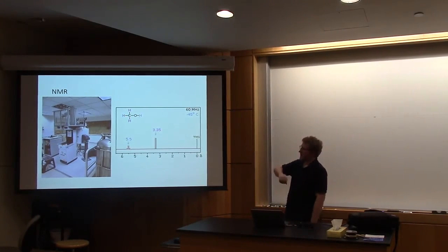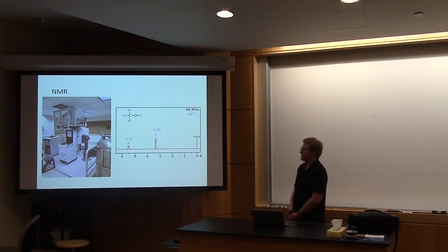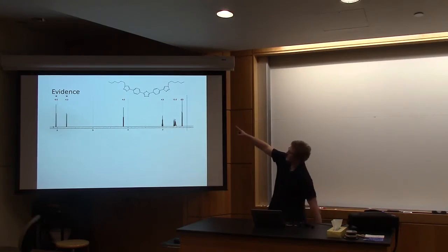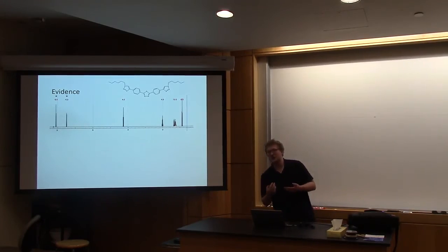Conversely, if we look at the 3 hydrogens on the carbon, they're all perfectly identical to each other by symmetry, which means that they will all appear as just 1 peak. But they are being interfered with by that hydrogen on the oxygen, giving us not 1, but 2 peaks, which would be integrated to show 3 hydrogens. And if you extrapolate from this, we can take it to some larger molecules to figure out what they are. So, just as a quick reminder, this is what I was ultimately looking for, my chemical. And this is an idealized computer-generated NMR of what it should look like.